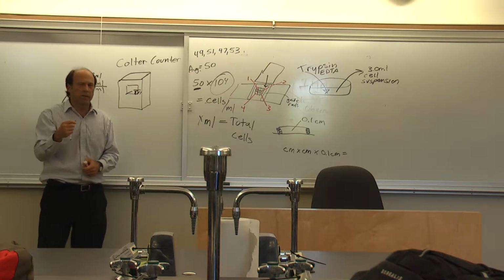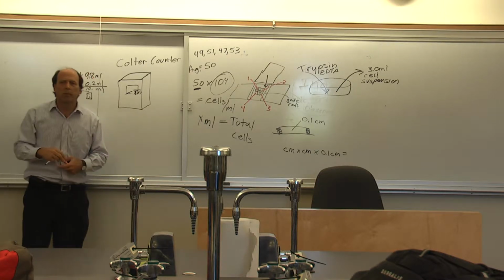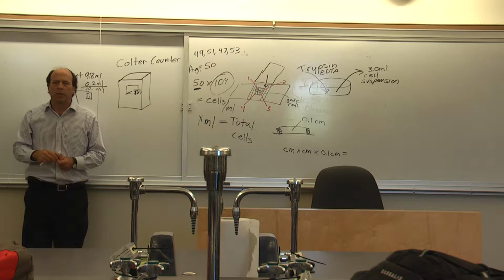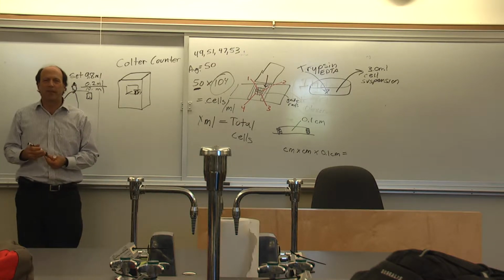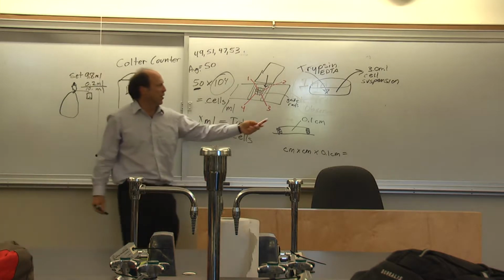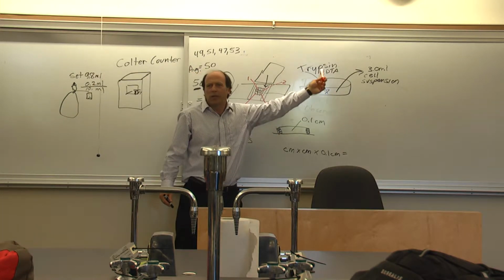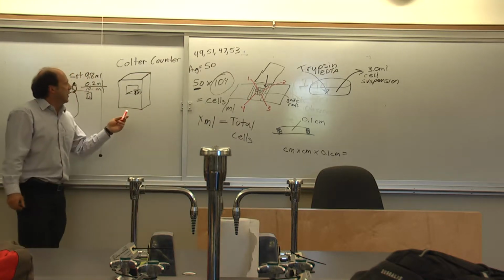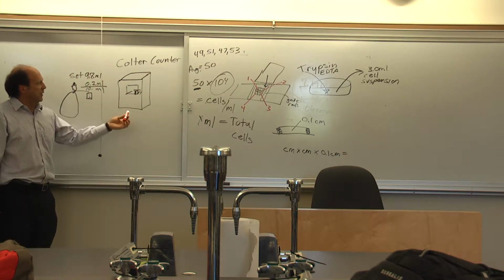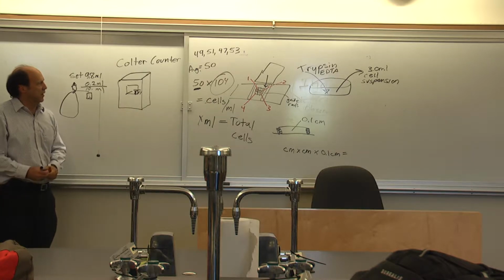So the number it's going to give you is a cell per mil number. It can never give you more than that because it doesn't know how many mils you have, and it could vary. In each experiment, you start with a plate of cells, and you might trypsinize with 2 mils instead. It doesn't know that unless you tell it, right?